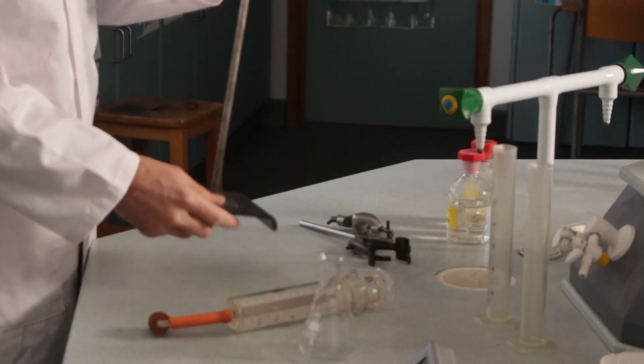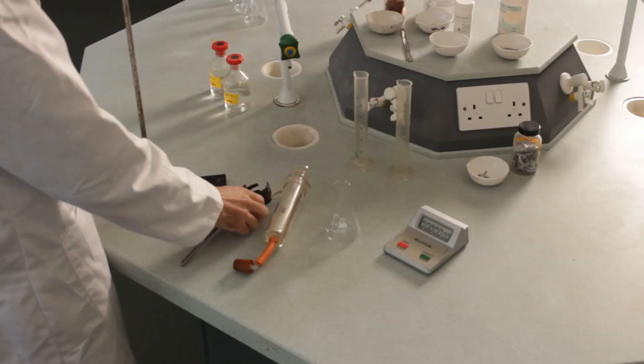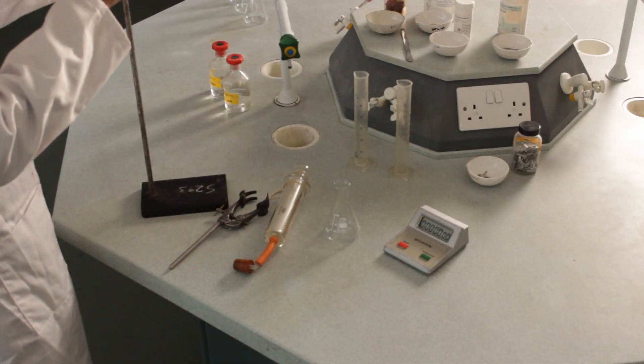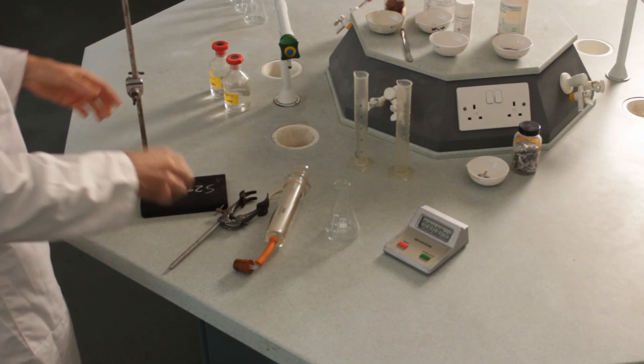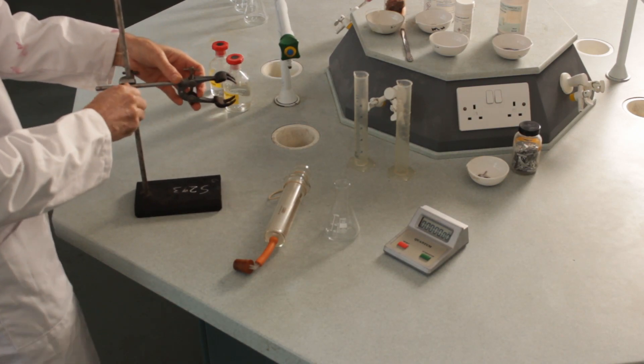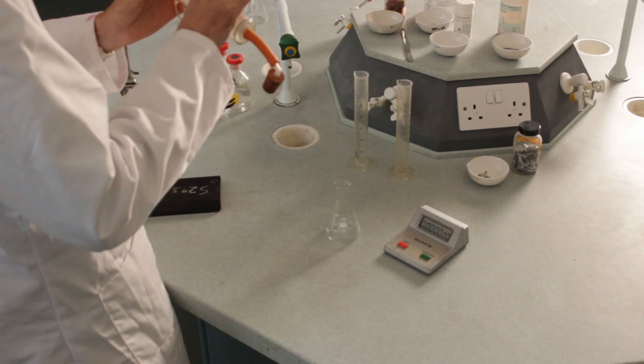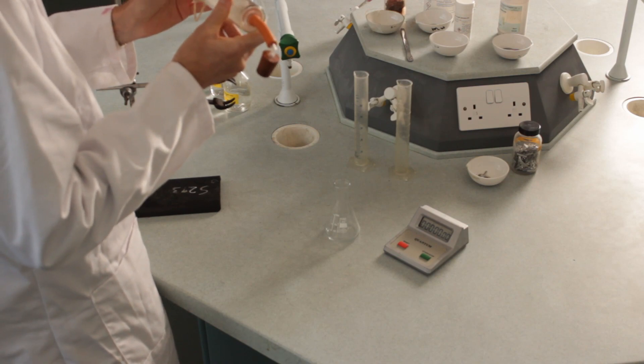This, of course, is a clamp stand and a clamp. And the bit which connects the two together is this, which is called a boss. Slide that on there, put this in here, and then clamp the gas syringe. I don't want to clamp it too tightly, otherwise it won't move. If you squeeze it really hard here, the barrel doesn't move.